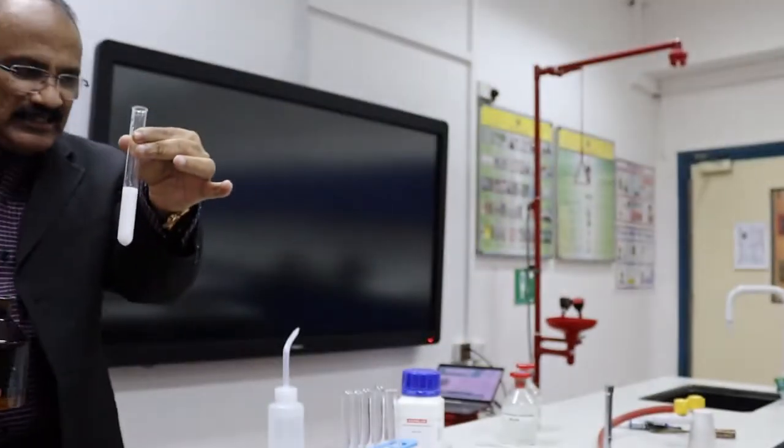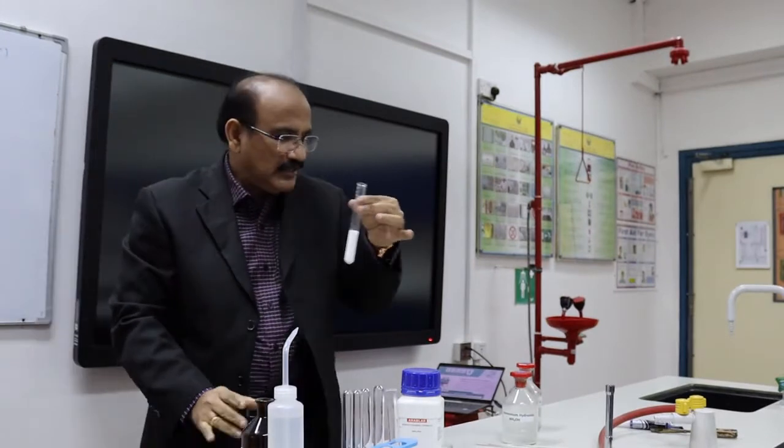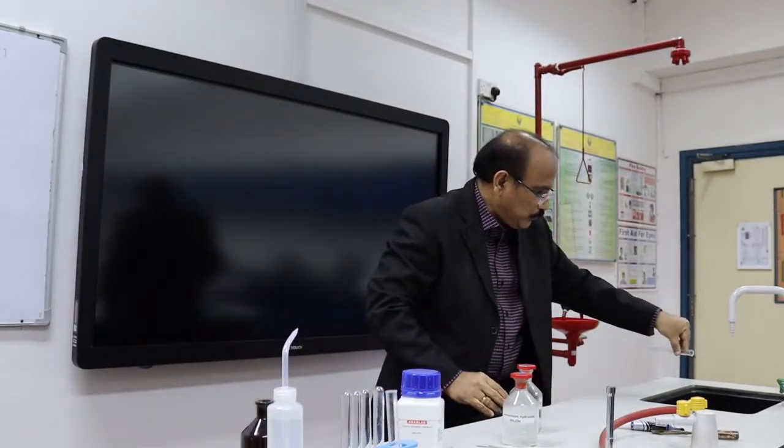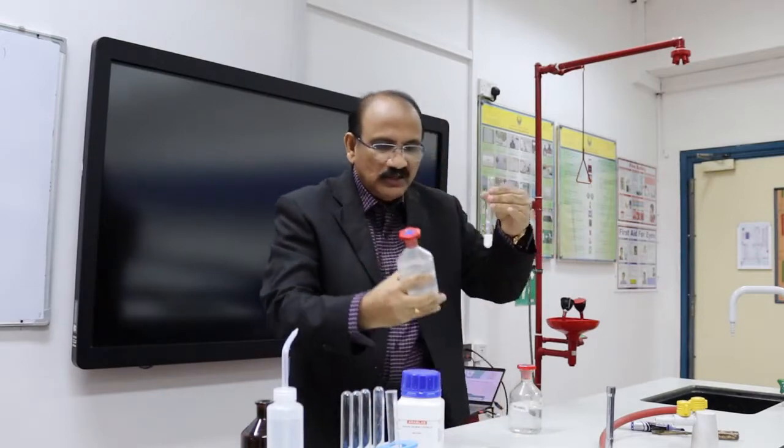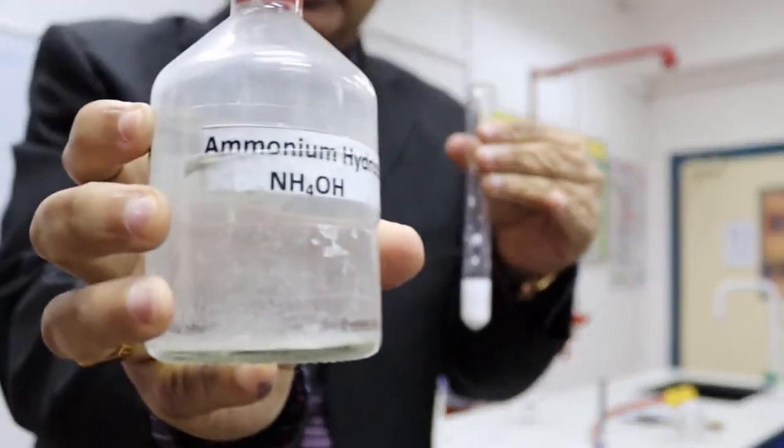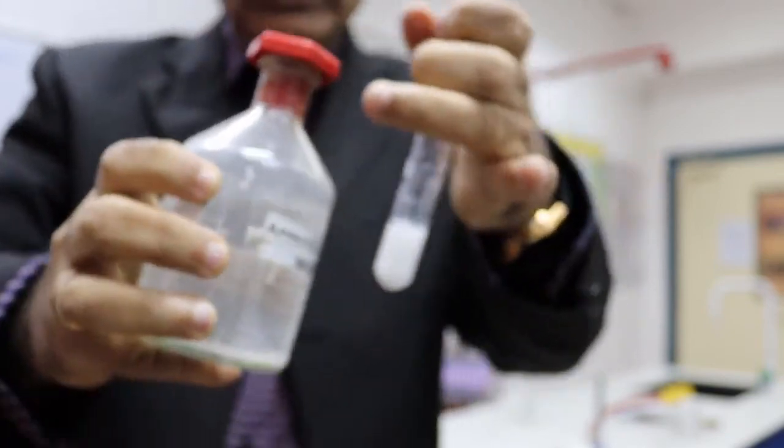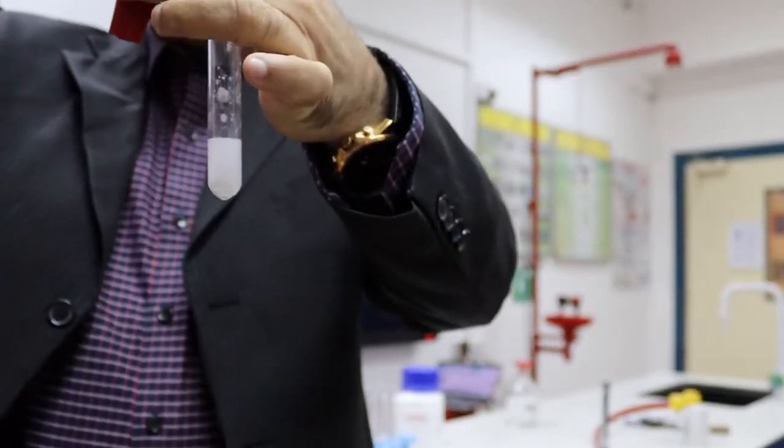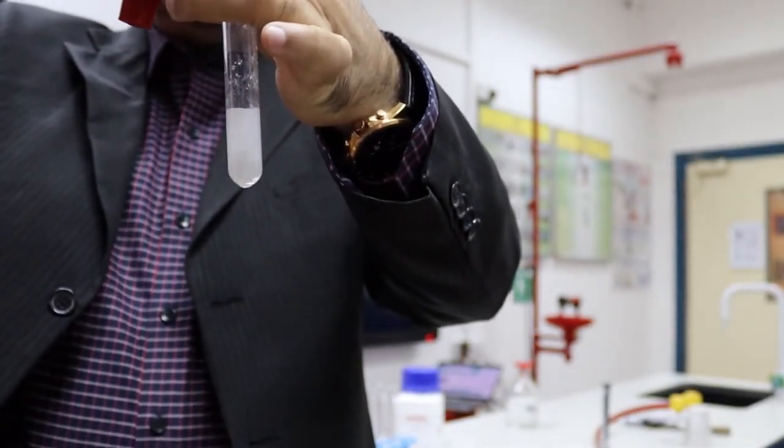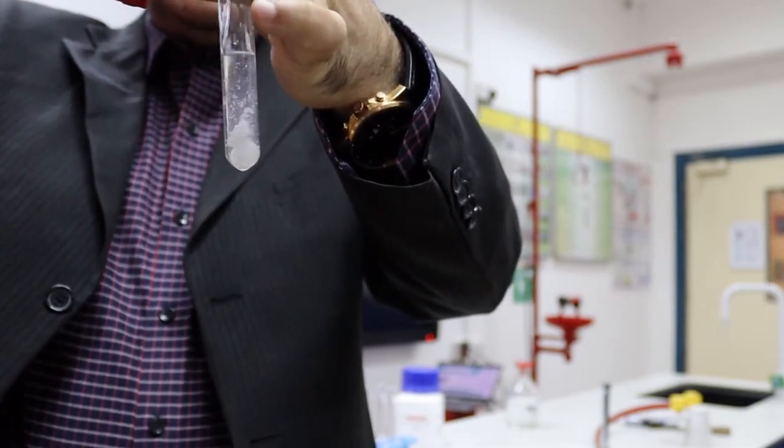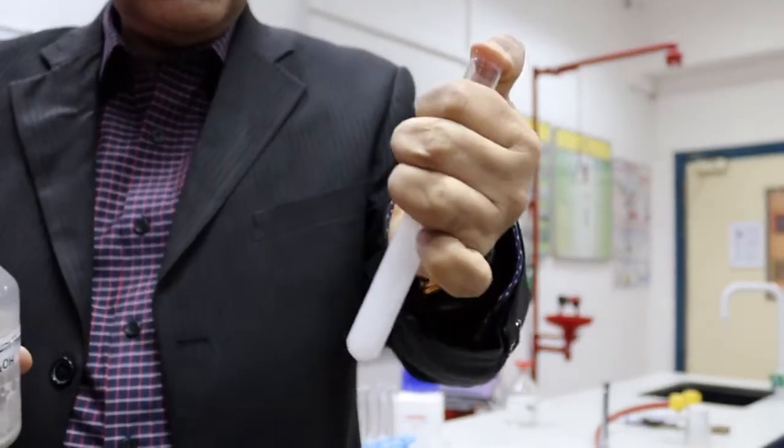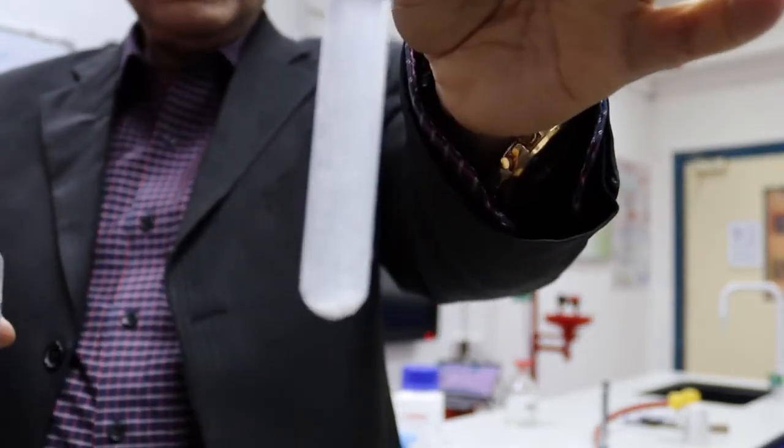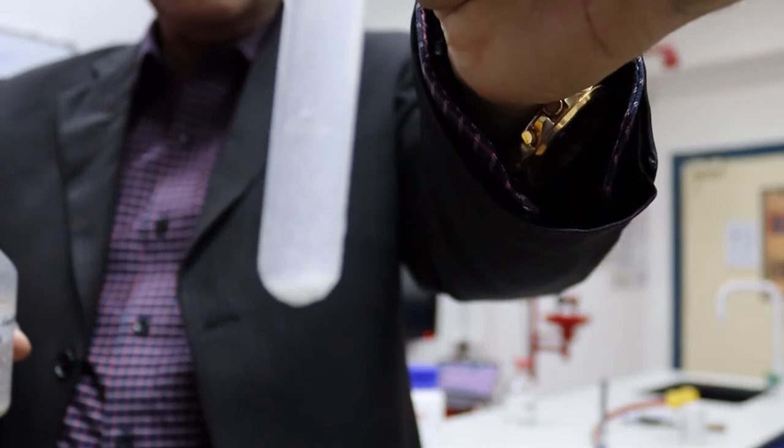So that is the confirmatory test. So what we will do, we will pour half of the precipitate, and then into that we have to add ammonium hydroxide. Ammonium hydroxide I am going to add. So let us see, ammonium hydroxide is added. It was a curdy precipitate. Now just shake it and see, the precipitate is getting gradually dissolved.